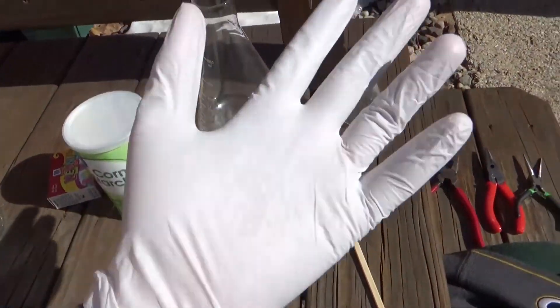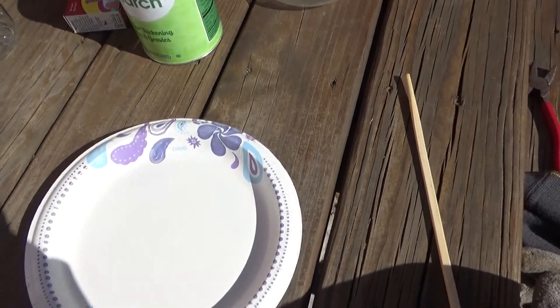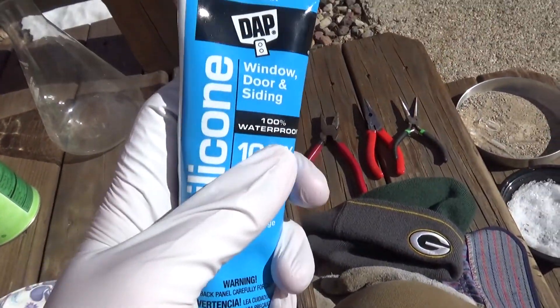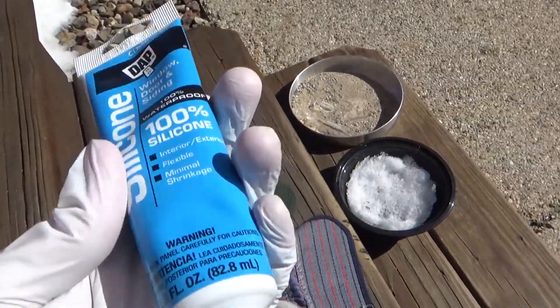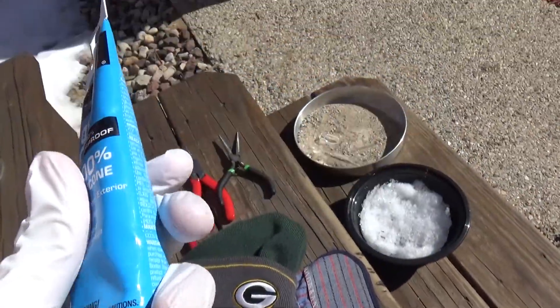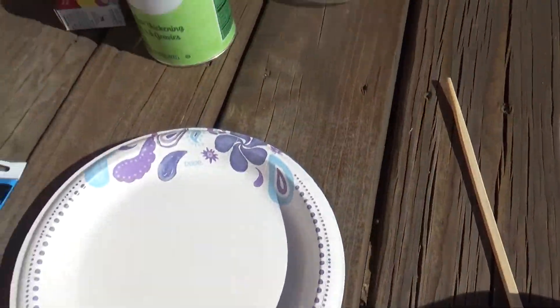I've got my gloves on. I shouldn't need goggles for this, but I do recommend doing this outside because the silicone we're working with uses acetic acid to cure and gives off a very strong smell. So I recommend doing it in a well-ventilated area or outside like I'm doing. Let's get started.